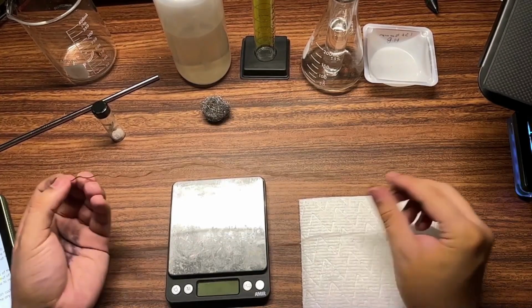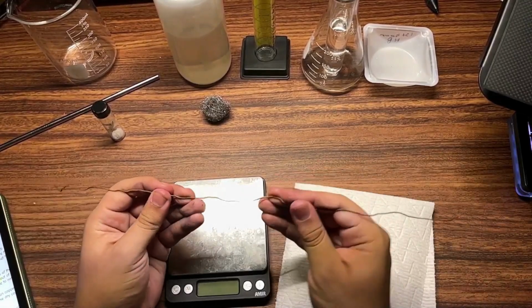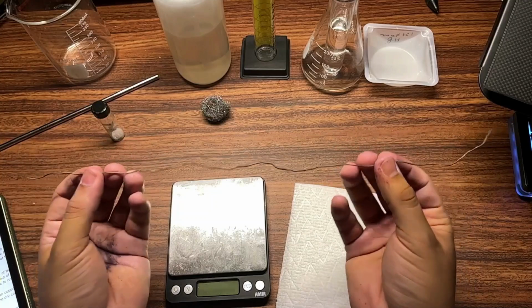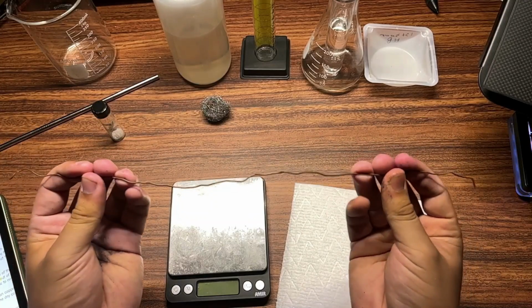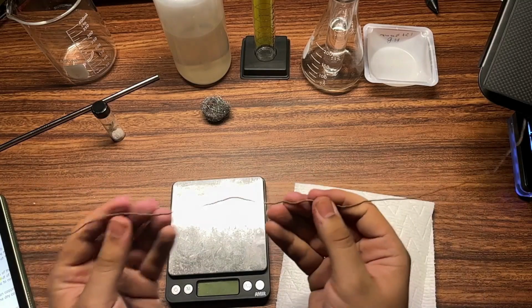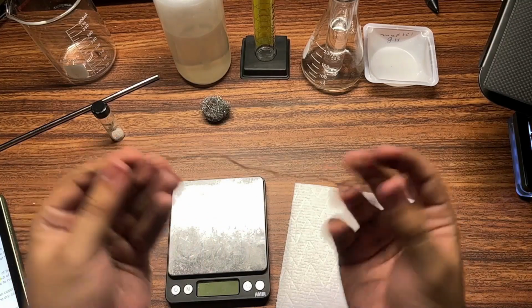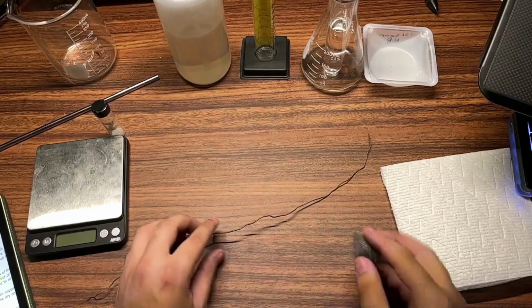Step one here is to get your copper wire. Here's my copper wire that I brought home with me. But as you can tell, and I hope you can tell, it's not very pretty. It doesn't look like shiny, nice copper. It's kind of dull, and that's because, like I said, it's been sitting for about a year and it hasn't been touched. So it's really oxidized, like all that copper is oxidized. But I can get rid of that, like I said, with a little bit of steel wool.